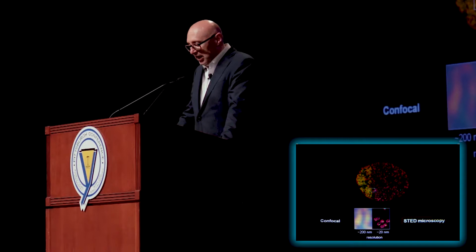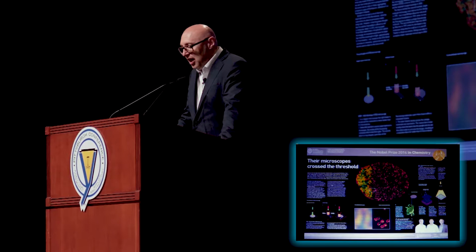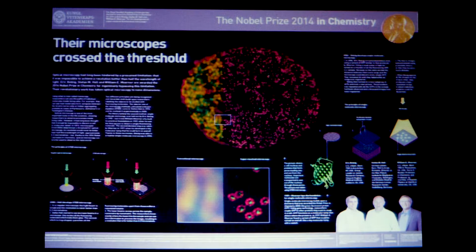Now, this achievement showing that there is physics, so to speak, in this world that allows you to get a much sharper picture than what people have believed for a century or more has actually led to the Nobel Prize in Chemistry in 2014. And actually, the STED picture is taken from the official poster of the Nobel Foundation for the 2014 Nobel Prize in Chemistry. And this poster shows a sketch of the STED microscope.